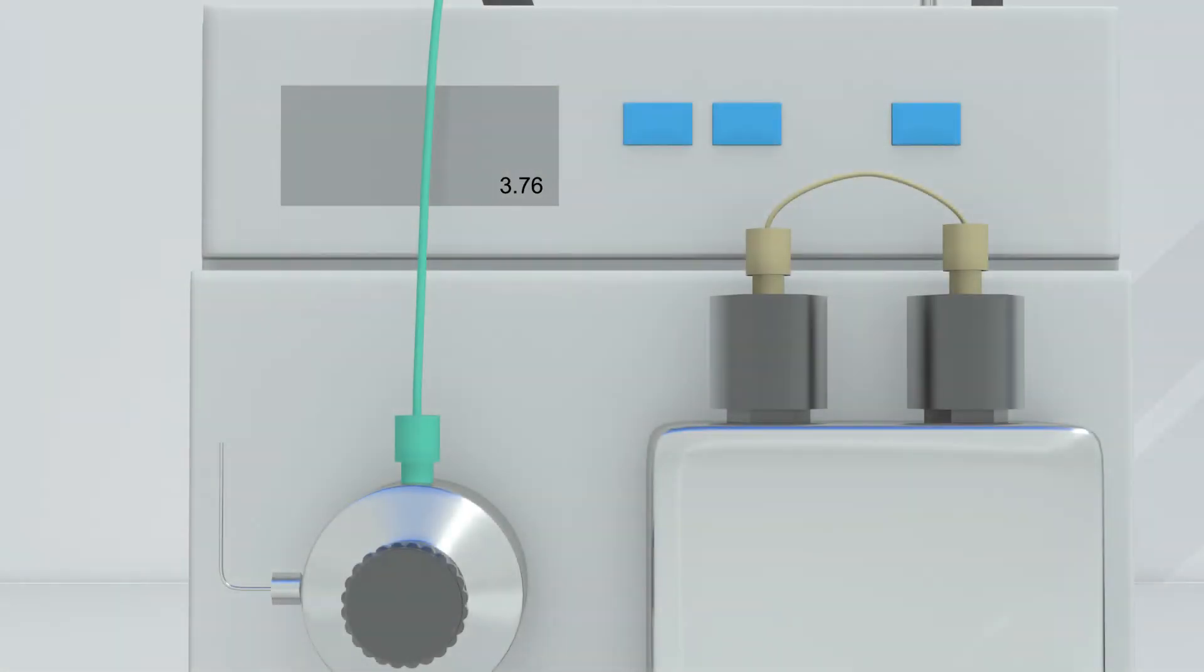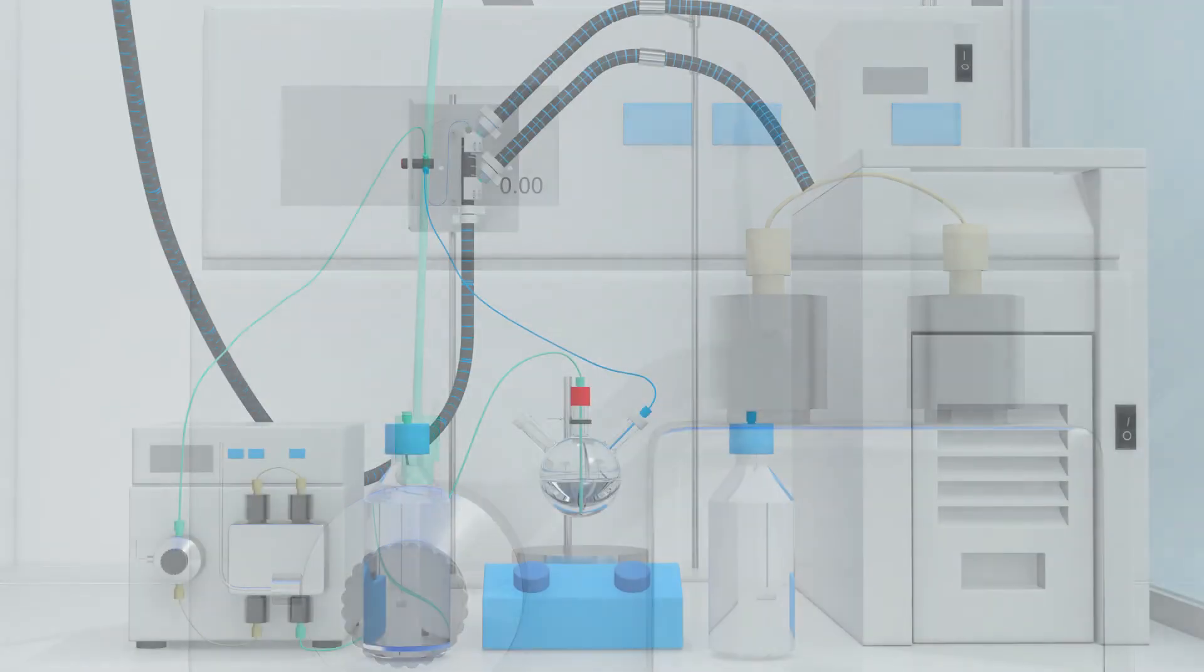This part of the presentation shows how to remove the flow tube assembly from the magnet once an experiment has been completed. Firstly switch the sample flow to OFF. Then disconnect the inlet from the reactor.